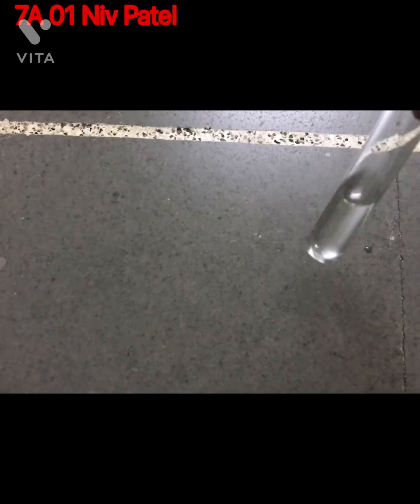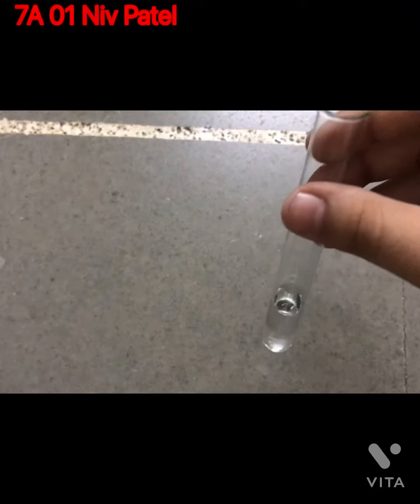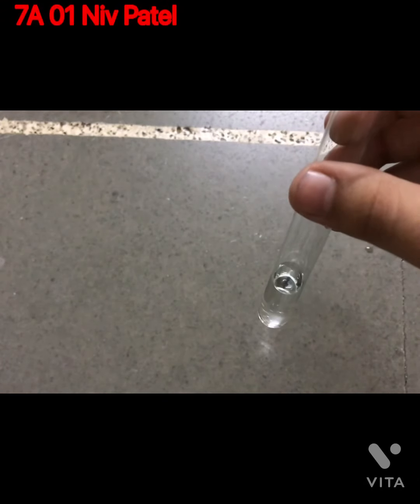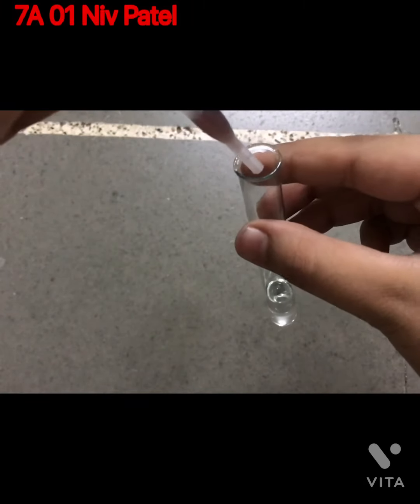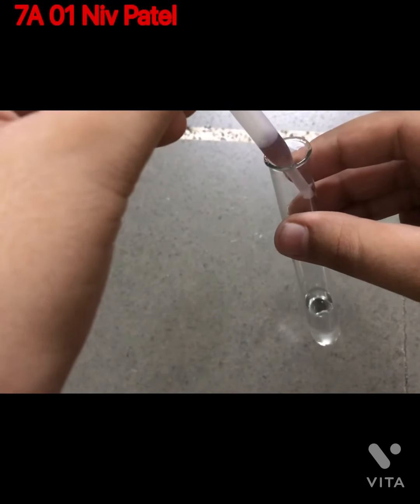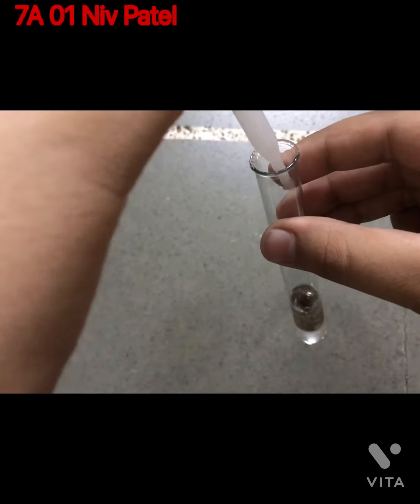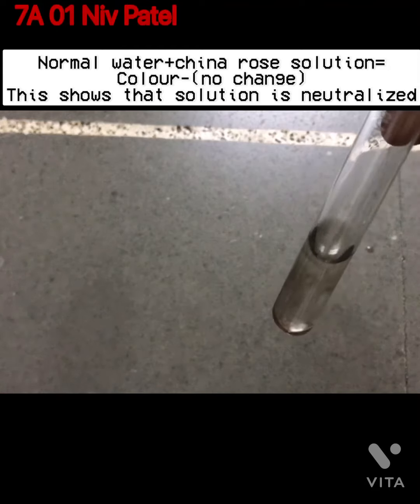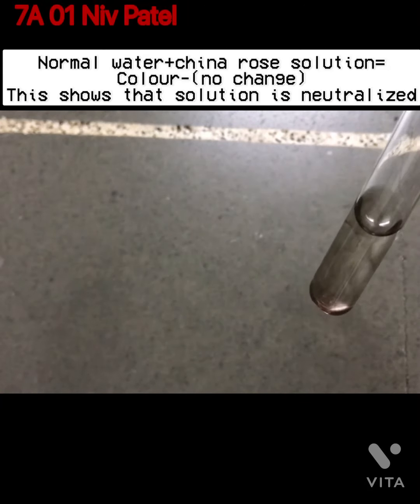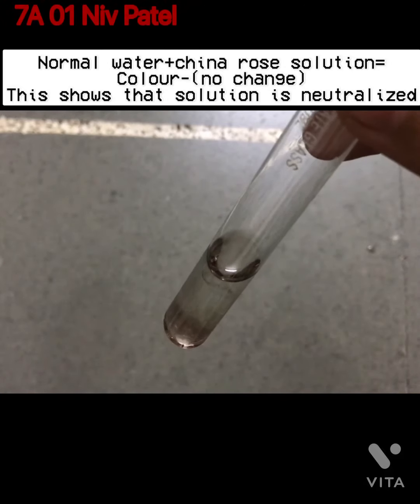I have taken another test tube filled with drinking water and we may test it with our China Rose solution. You can see that there is no color change in the drinking water, so this shows that the solution is neutral.